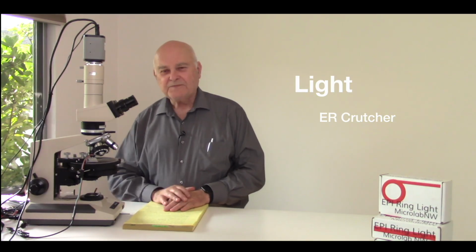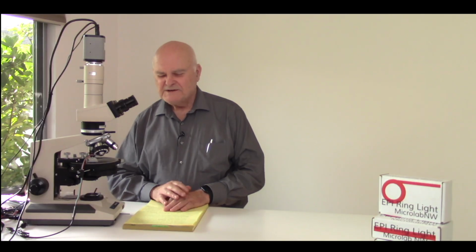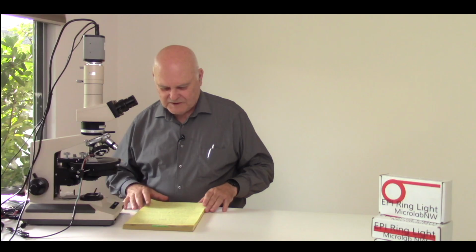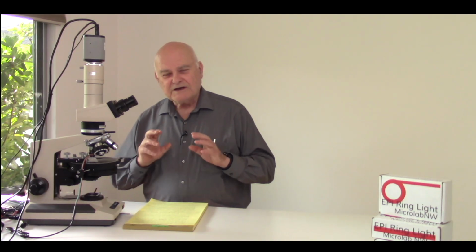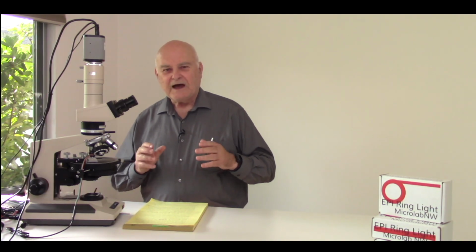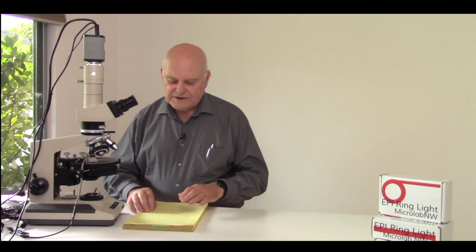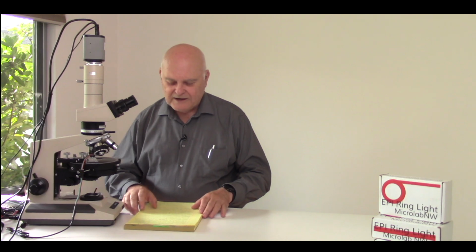Today I thought we'd go into a little bit of the background, the physics that's involved in microscopy. Just a bit. I don't want to make this a class in physics, but it's nice to understand how light interacts with matter. In order to do that, we need to consider a couple of simple features. One of them is the fact that light can be modeled effectively as a wave.